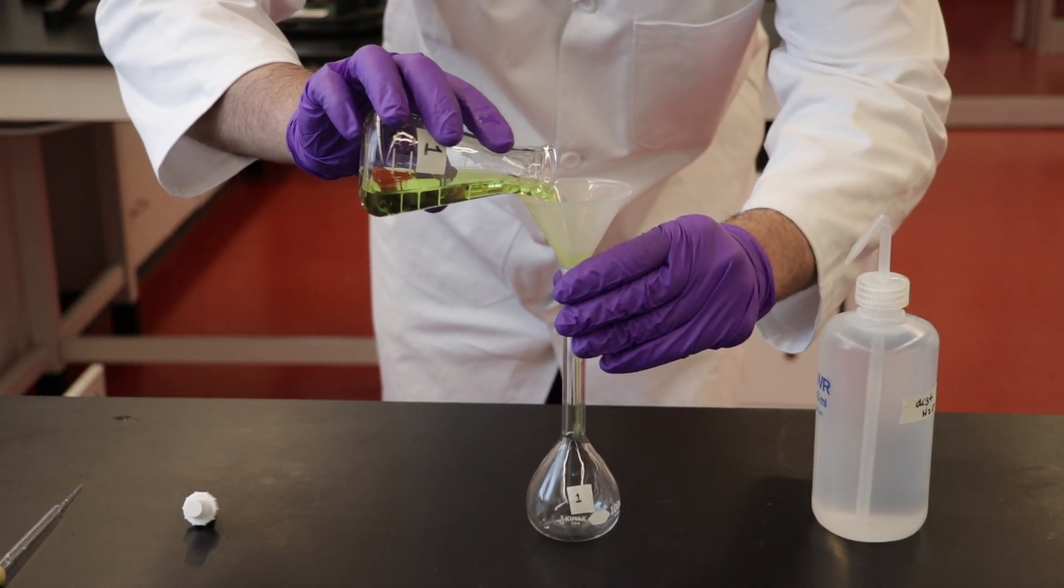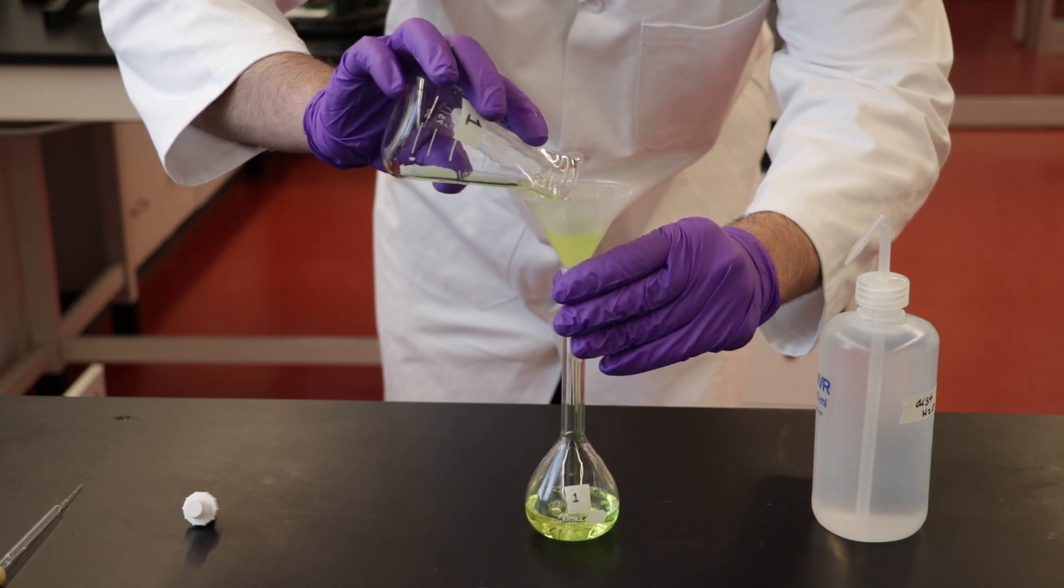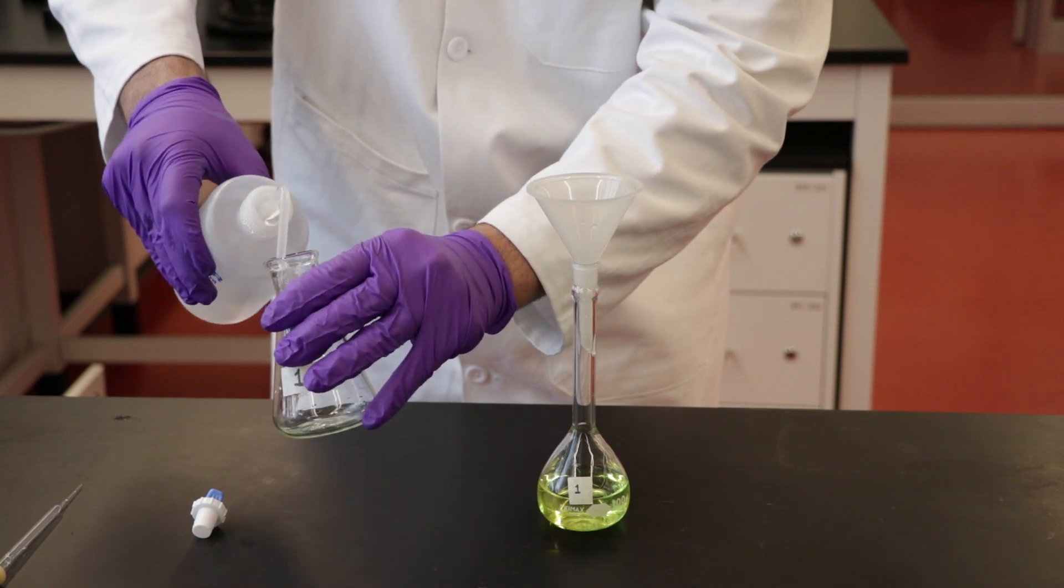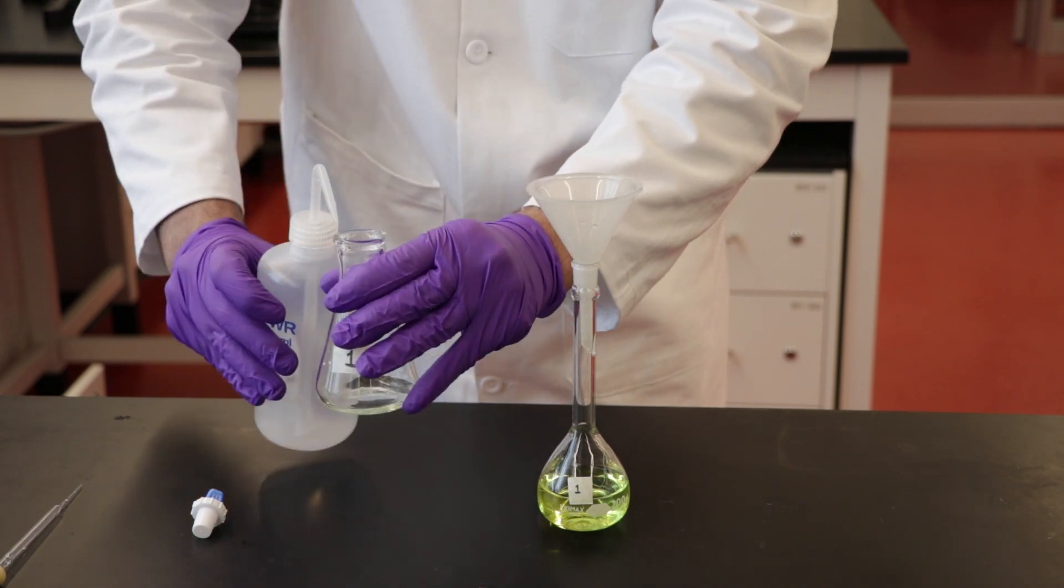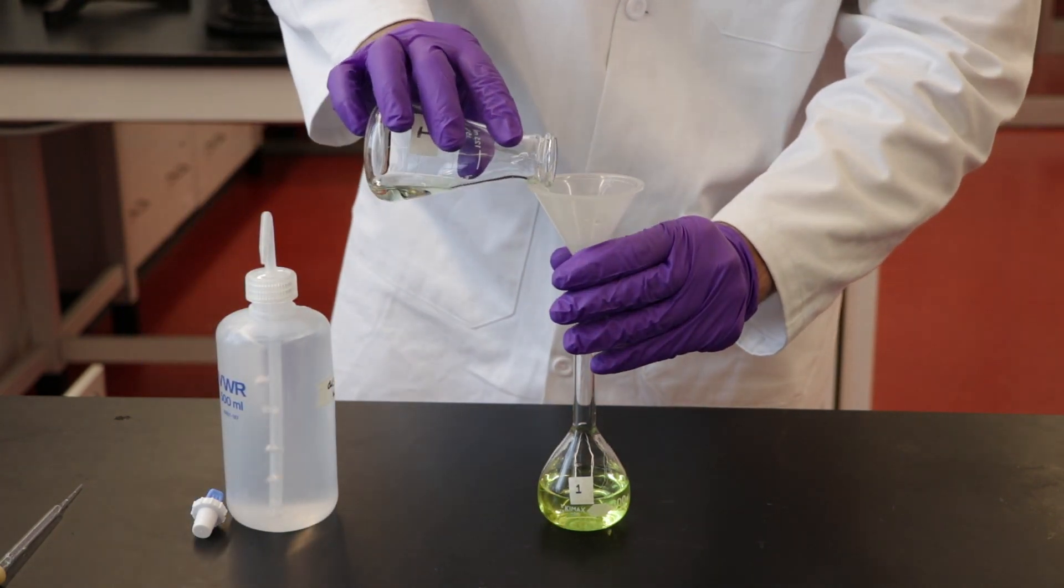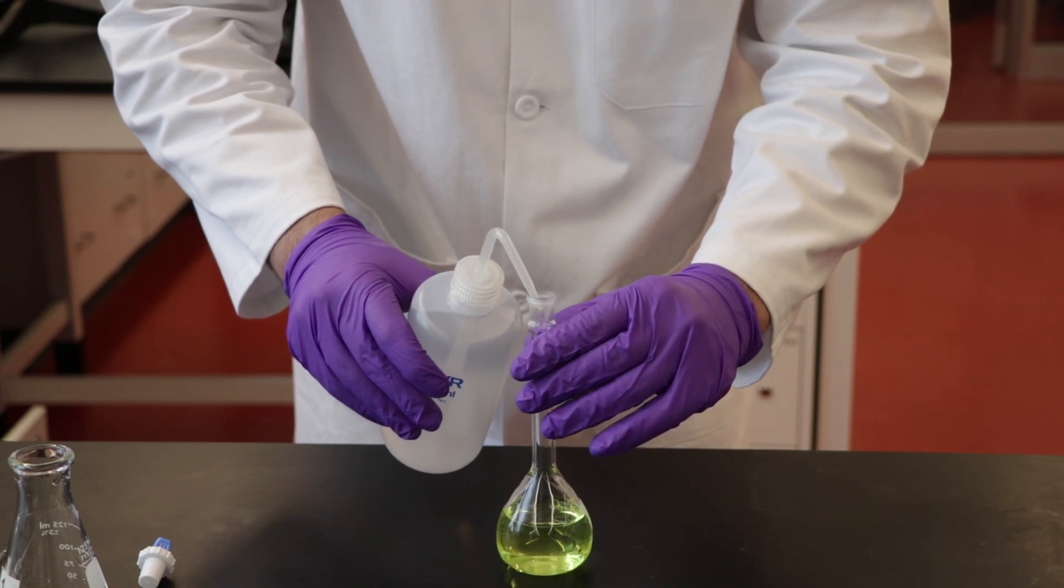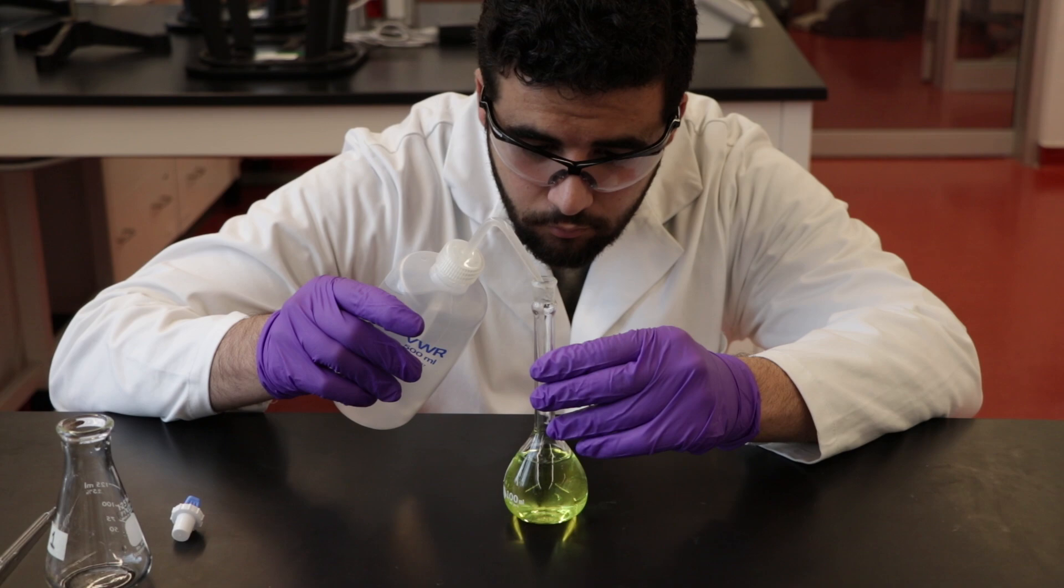Using a liquid funnel, transfer the contents of each Erlenmeyer flask into the corresponding volumetric flask. Use a wash bottle with distilled water to rinse the inside of the Erlenmeyer flask and transfer the contents to the volumetric flask. Rinse the funnel and the neck of the volumetric flask. Fill the volumetric flask with distilled water until the beginning of the narrow neck.